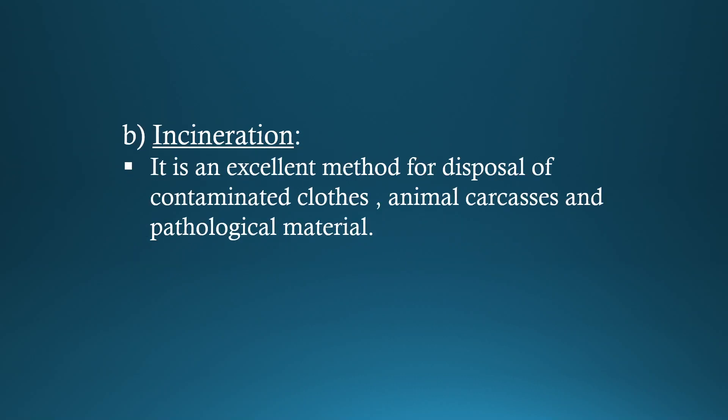Incineration. It is an excellent method for disposal of contaminated clothes, animal carcasses and pathological material.